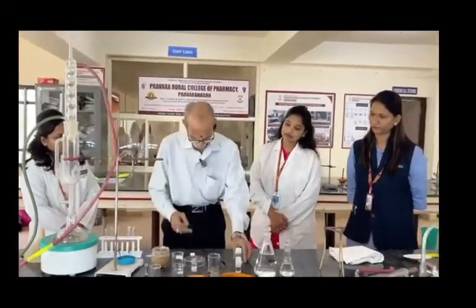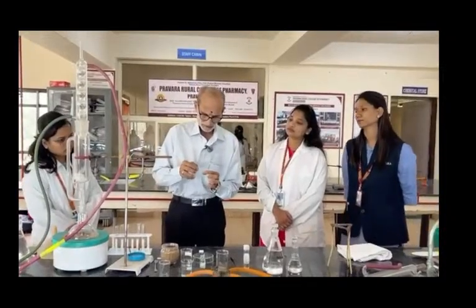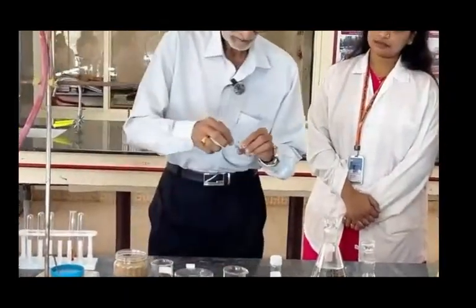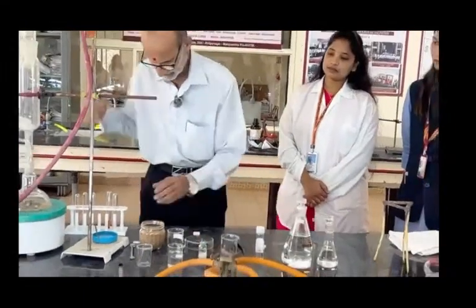Now our sample is ready, and we will be putting two tracks on the TLC, one of the standard and one of the test. Once you get a corresponding spot in the TLC solvent system, that is the indication that yes, your raw material has embelin in it, and that is what we precisely did. On the left side, I will be putting the standard track. So you can see the demonstration of TLC on my left side.